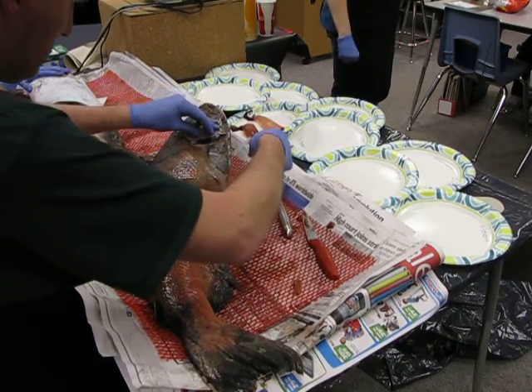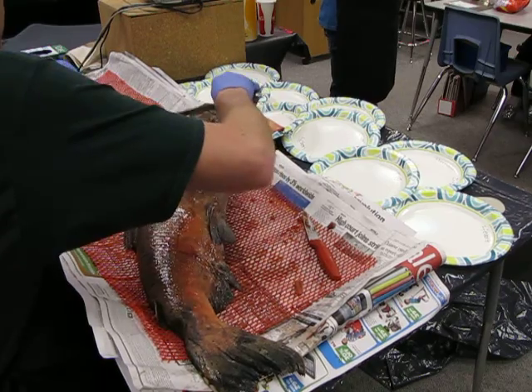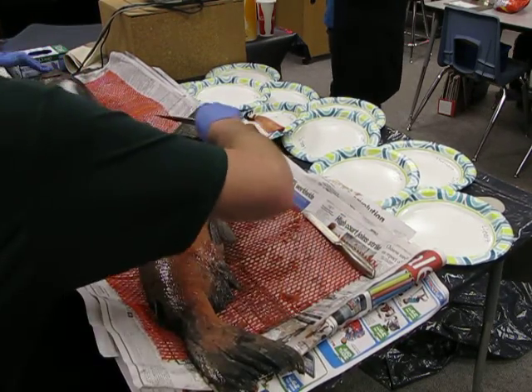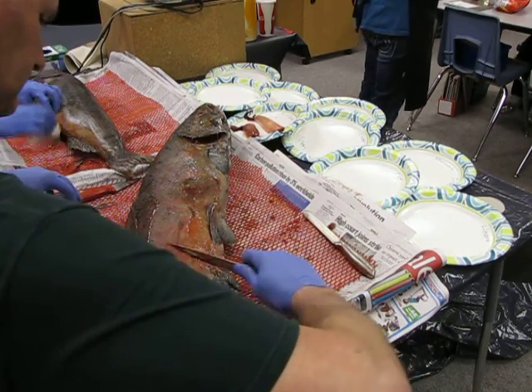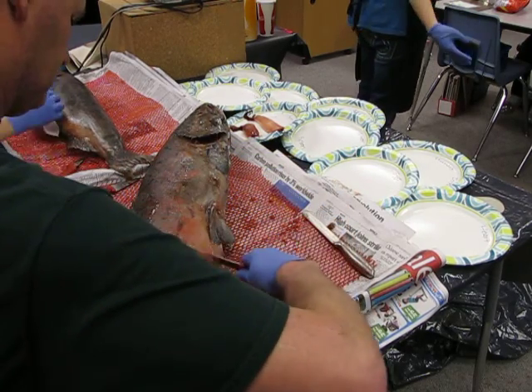The second job of the mucus, like I said before, is to protect the salmon. How many of you have ever been fishing? Tried to hold on to that fish with your bare hands? I have. It's slippery and gets out and everywhere. Yeah. We are salmon predators, you and me. So if we're trying to catch a salmon and it's slippery, it might get away. That mucus helps them survive.